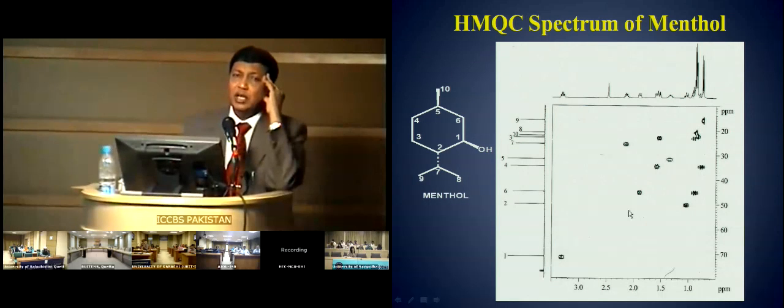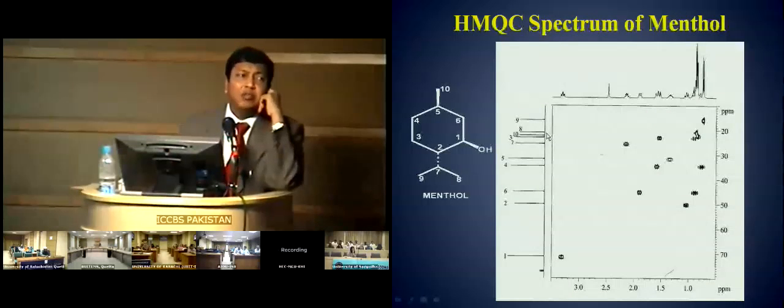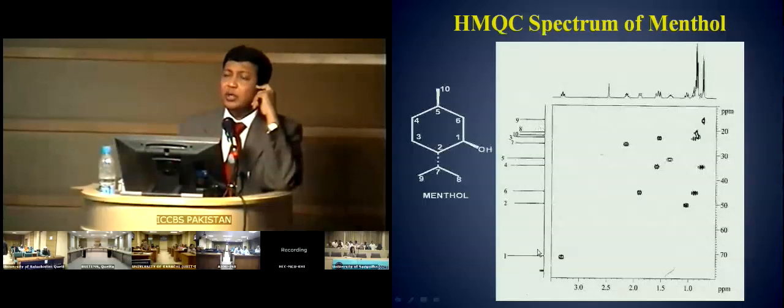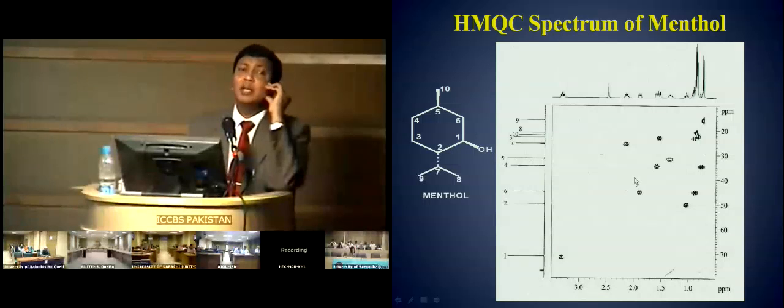In this case, you would be able to have the chemical shift of all the carbons with reference to their effect on proton. This carbon-13 NMR spectrum is separately recorded and pasted on it. Please do not think that it was generated through carbon-13 NMR spectroscopy. It is a pure 100% proton NMR spectroscopy.